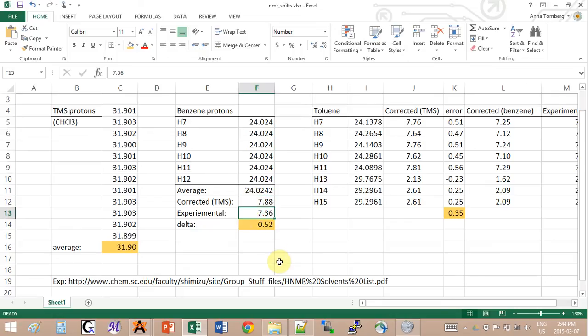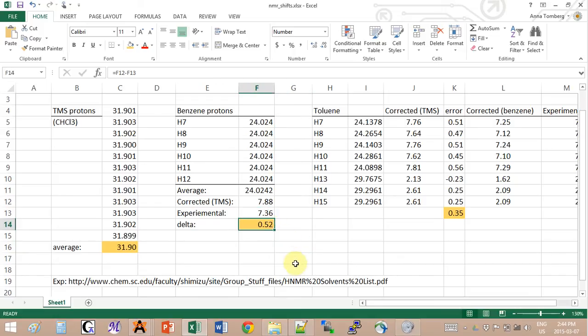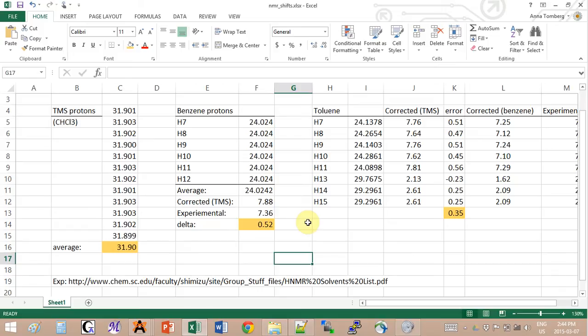So you do 31.9 minus 24.02 and you get 7.88. Now if you look at the experimental value, you will see that it's actually 7.36. So I have an error of 0.5, which is not that great.